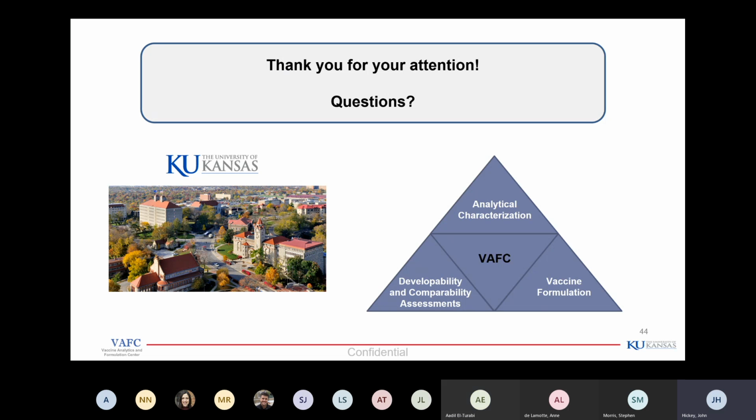Yes. So we are a little bit lucky in that we don't do any production here. We get material from our collaborators and clients, which is typically quite pure material. So it makes performing these assays fairly easy. But I showed a little bit of this earlier with our collaboration with MIT and UCL, where even the material coming out of the cells is still 80 to 90% pure.